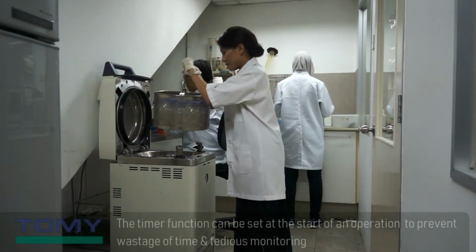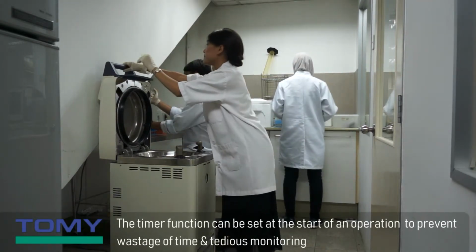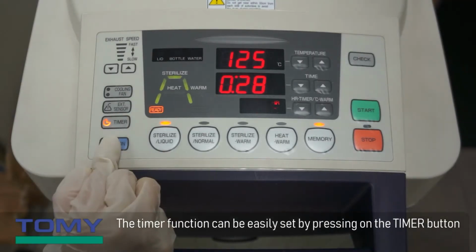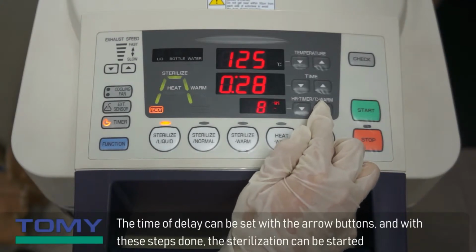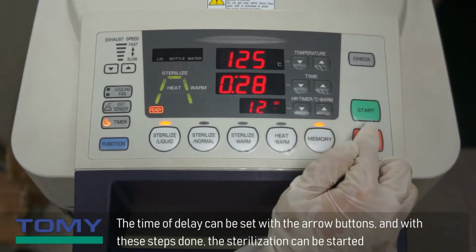The timer function can be set at the start of an operation to prevent wastage of time and tedious monitoring. The timer function can be easily set by pressing on the timer button. The time of delay can be set with the arrow buttons, and with these steps done, the sterilization can be started.